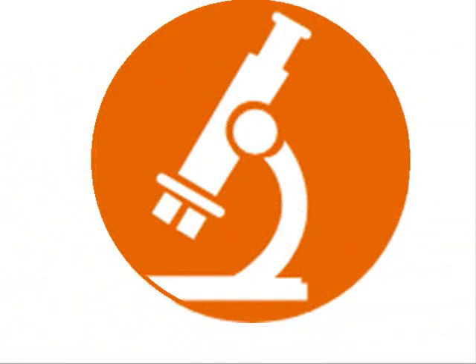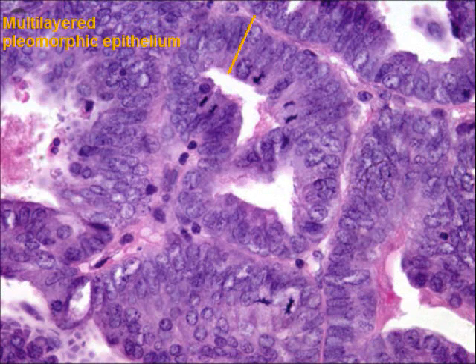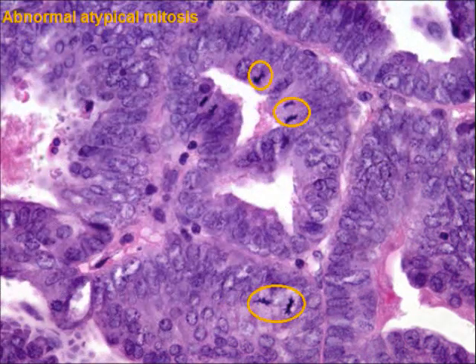Looking at the histology of the mass under the microscope, this reveals a complex epithelial growth pattern. There is little intervening stroma between the glands, and there is branching of large glands forming papillary structures. Under high power, there is multi-layered pleomorphic epithelium and frequent abnormal mitoses — all features of malignancy.